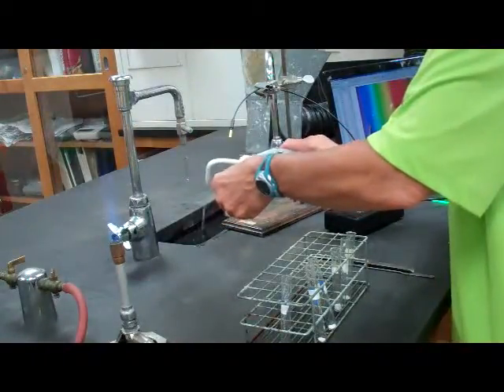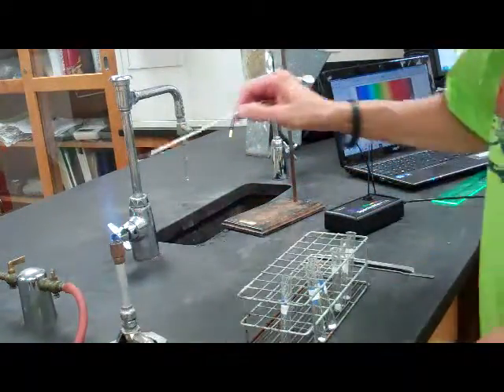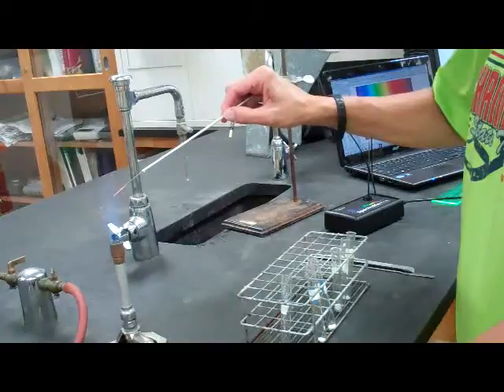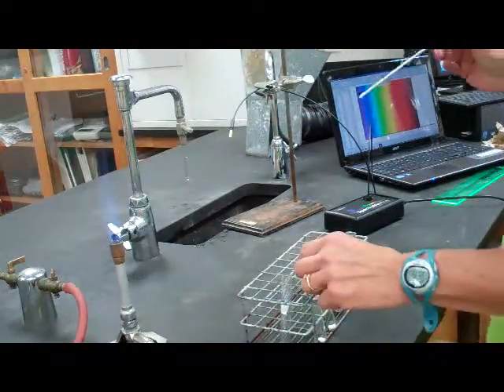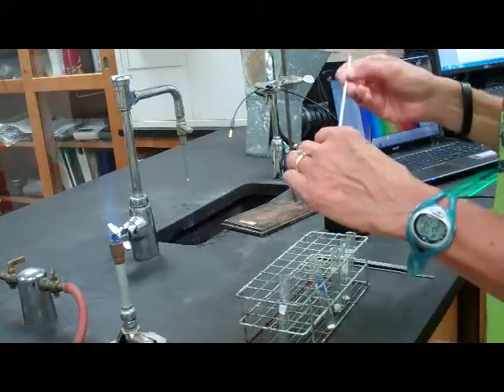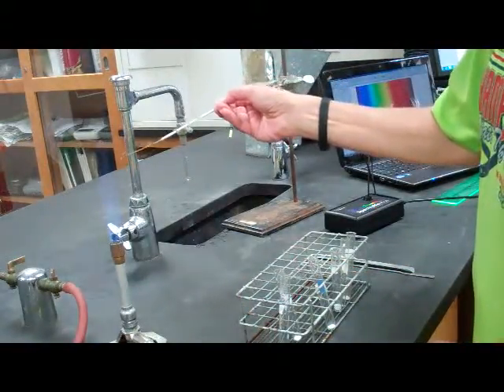So, just to be safe, avoiding contamination, burn the loop. Rinse the loop with the distilled water, and just like you do in biology, burn from the handle towards the loop end. And as we see, we have all our sample off. My next salt is going to be sodium chloride. So I put a sample of sodium chloride on the loop itself, into the flame.